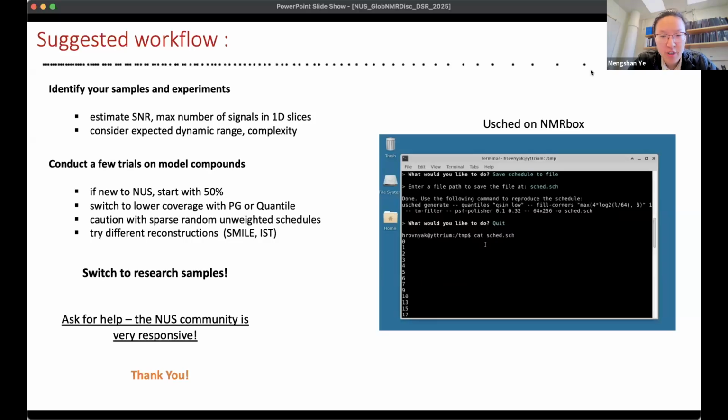So the third question is, are there scenarios where it's better to oversample data points, say 2 times the phase cycle, instead of doubling the amount of NUS points?